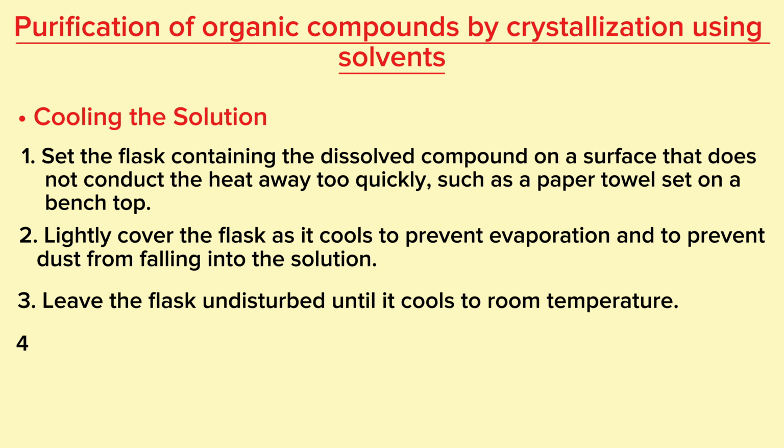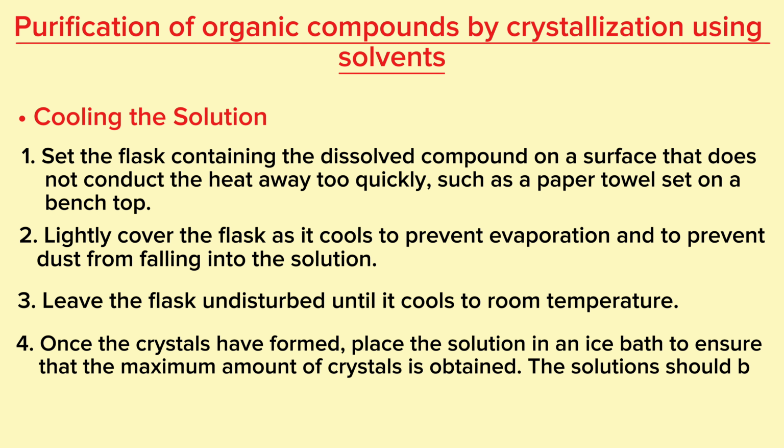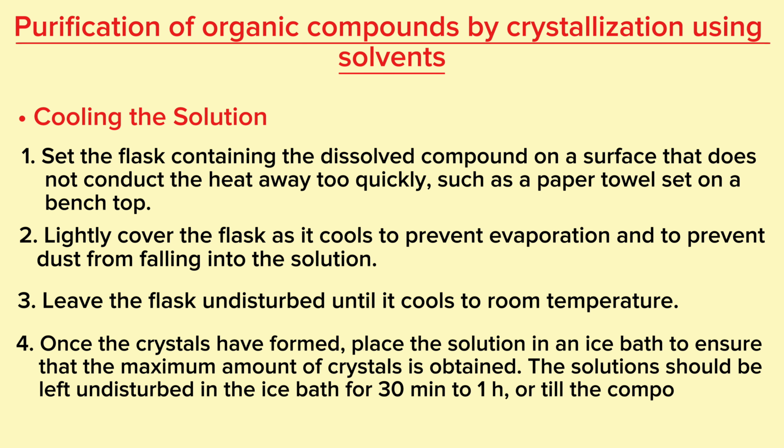Once the crystals have formed, place the solution in an ice bath to ensure that the maximum amount of crystals is obtained. The solution should be left undisturbed in the ice bath for 30 minutes to 1 hour, or until the compound appears to have completely crystallized out of solution.